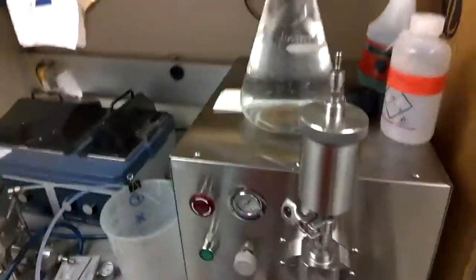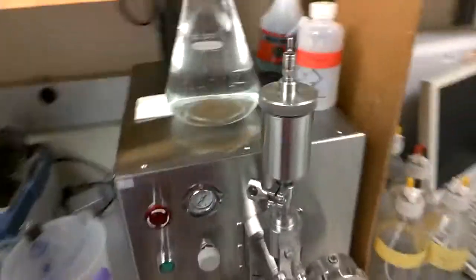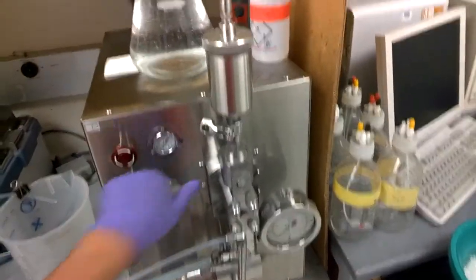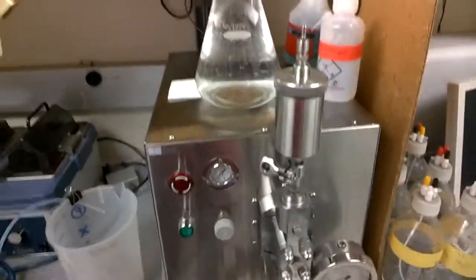So next thing to do is to turn the Emulsiflex on. So there's two controls, there's an electrical pump control, and there's air pressure control over here. And so first we need to actually turn on the electrical power to the Emulsiflex, and it's here in the back.